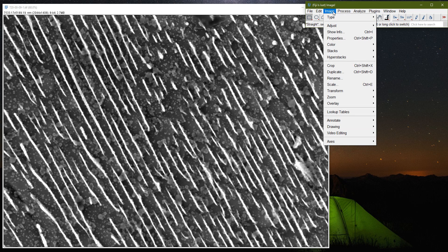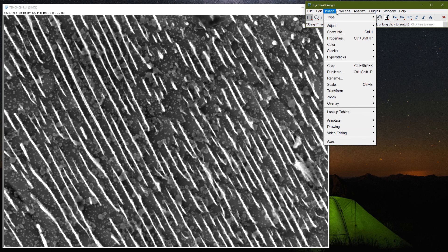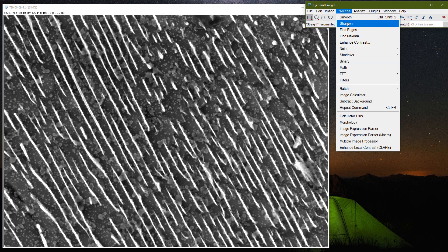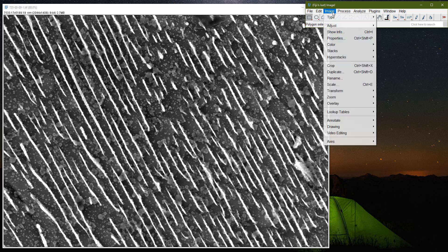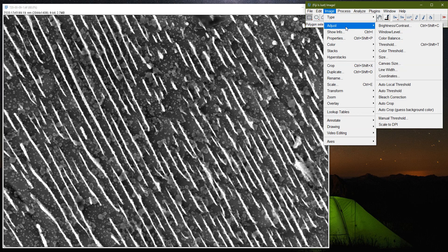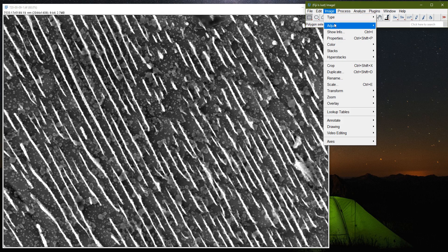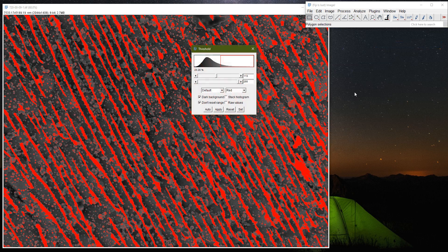Next, I want to process and sharpen the image a little so the features become more pronounced. I will apply Sharpen, and then go to Image > Adjust > Threshold to adjust the threshold of my features.